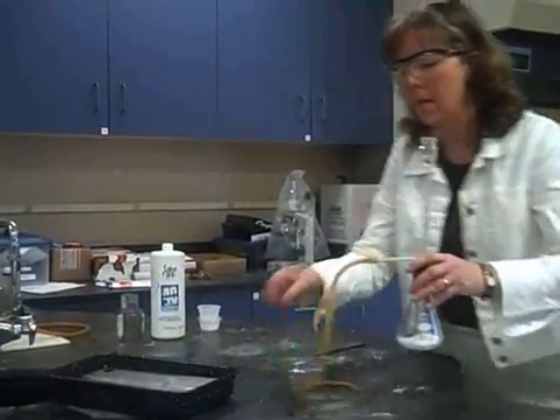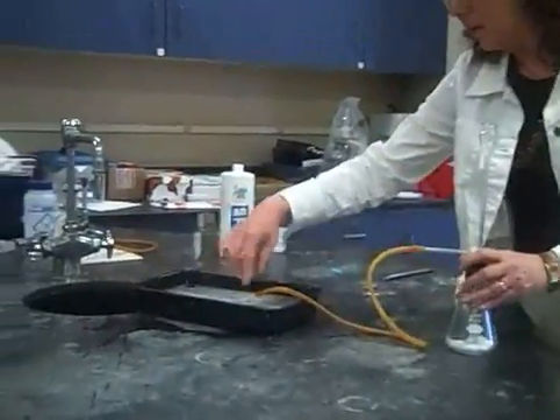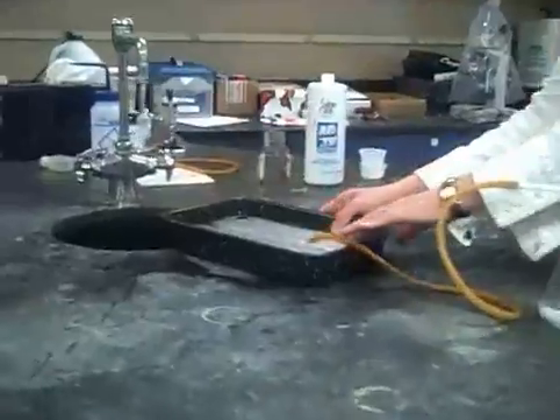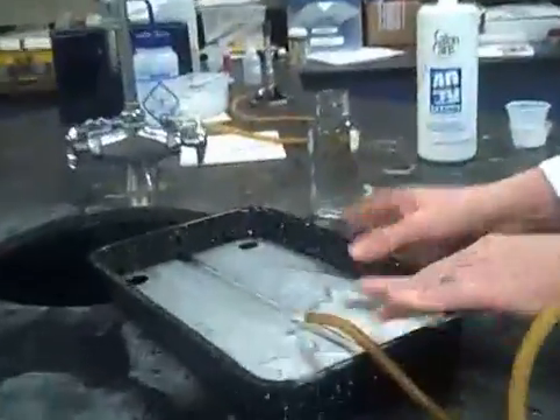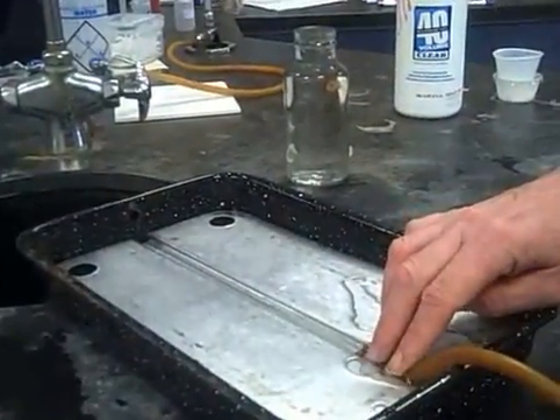If you'd notice, look at this pneumatic trough — see that there's this line. Can you see the line in it? If I tilt this, can you see that there's an open edge here that allows me to put the tubing in here?